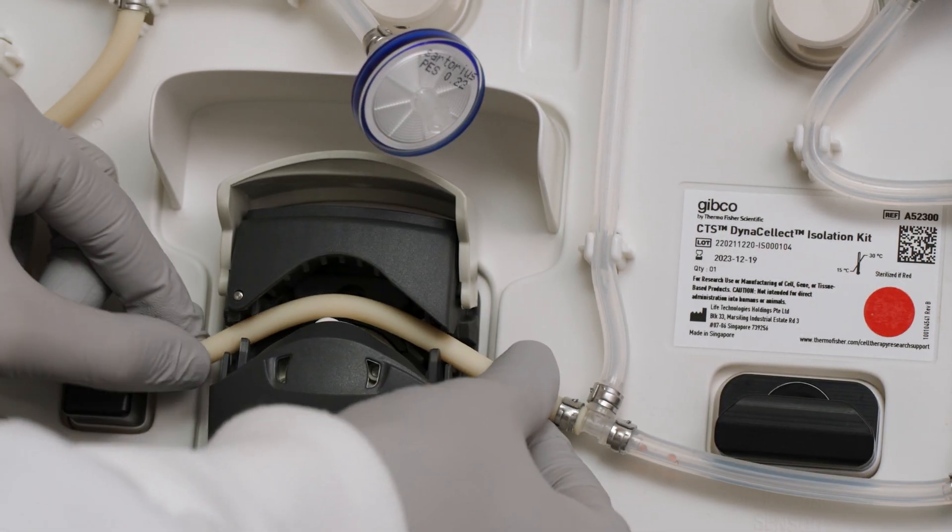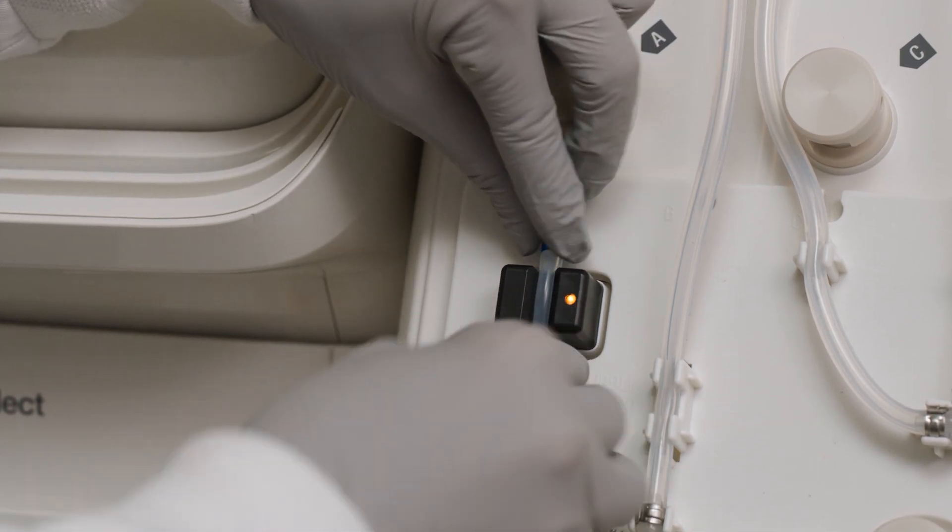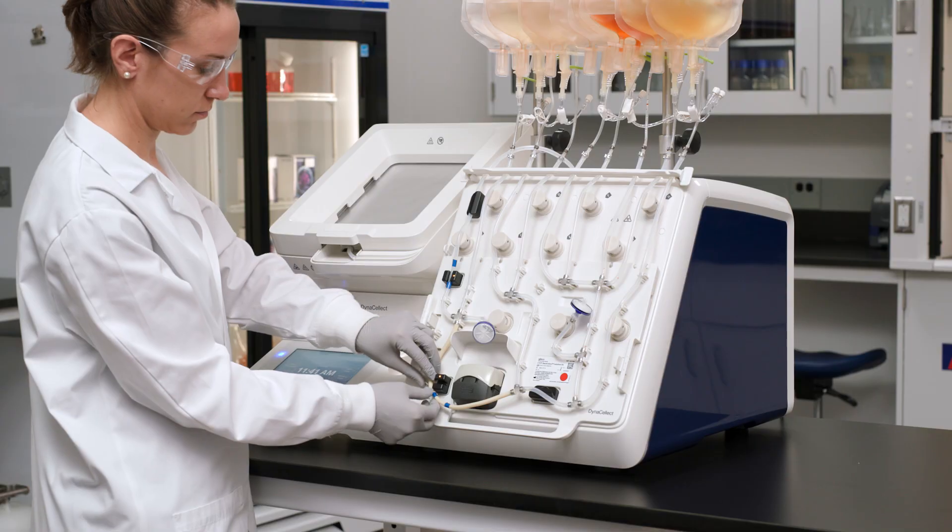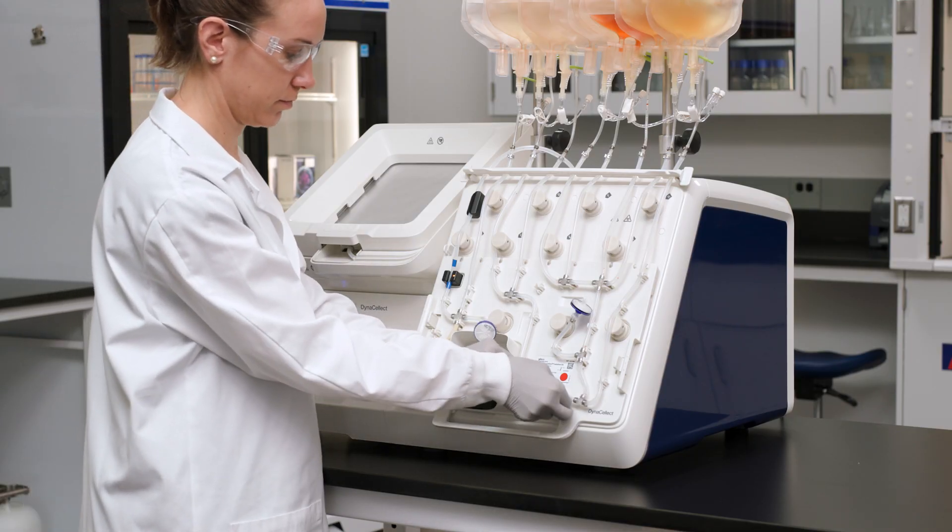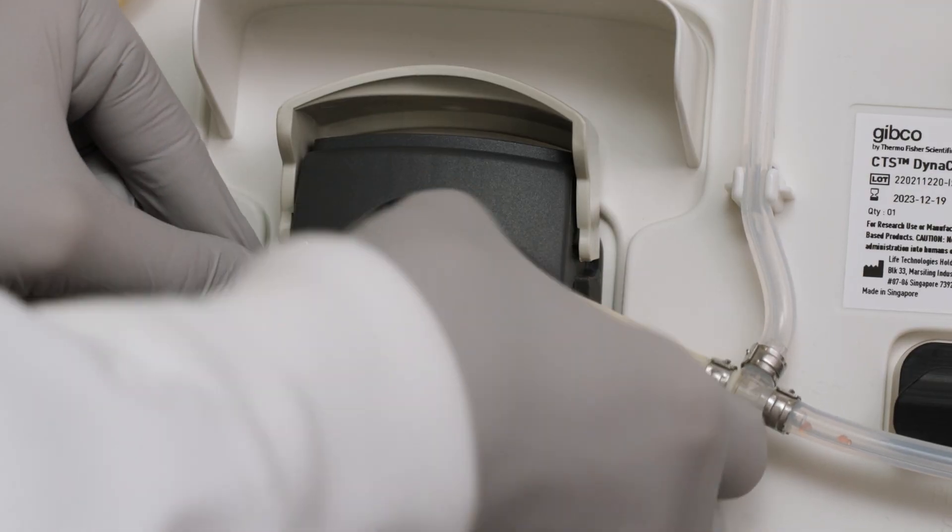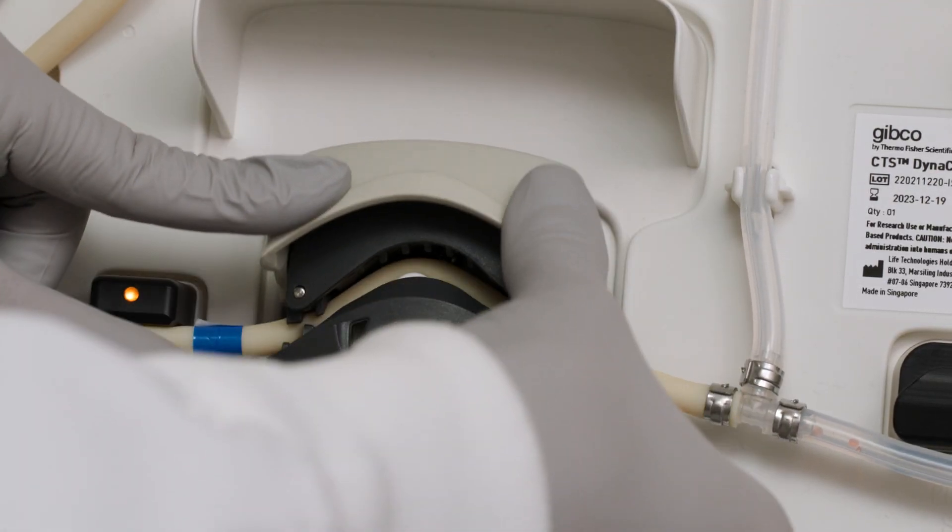Next, install tubes in the pump, bubble, and pressure sensors. Ensure that the tubes are seated all the way into the recess of the sensors. Insert the tube into the pump and close the pump lid.